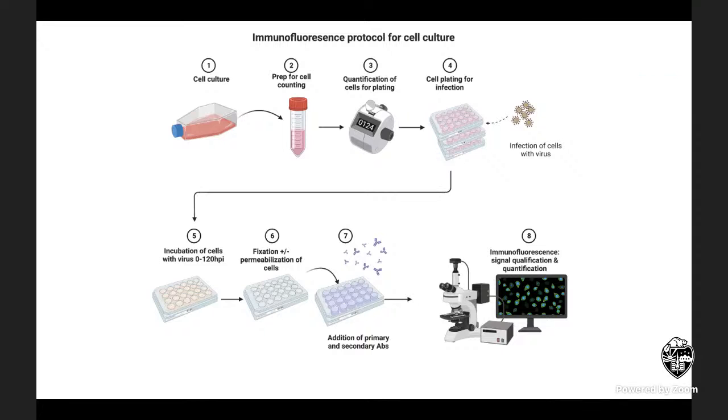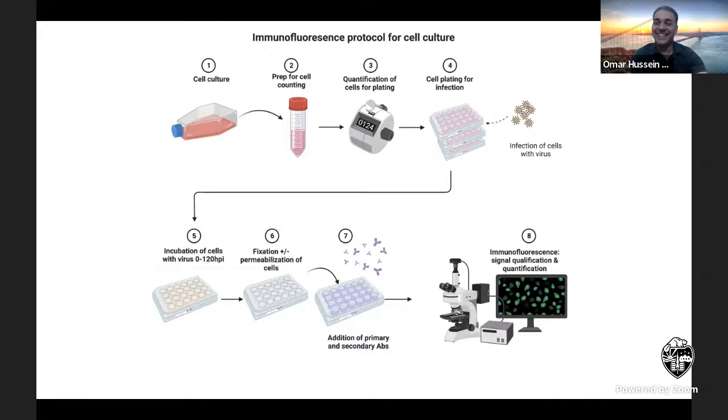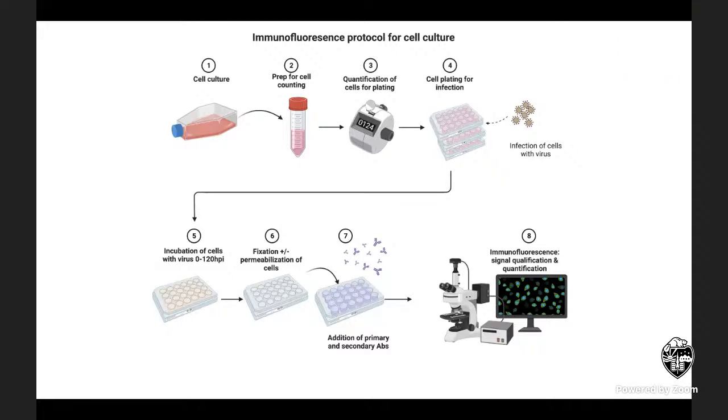I'm gonna ask a question before somebody raises their hand. Do you have, Dr. Shakira, a problem with the autofluorescence? Because when using tissue sections in pathology, we do a lot of staining on the tissue sections. So do you have a problem with autofluorescence?